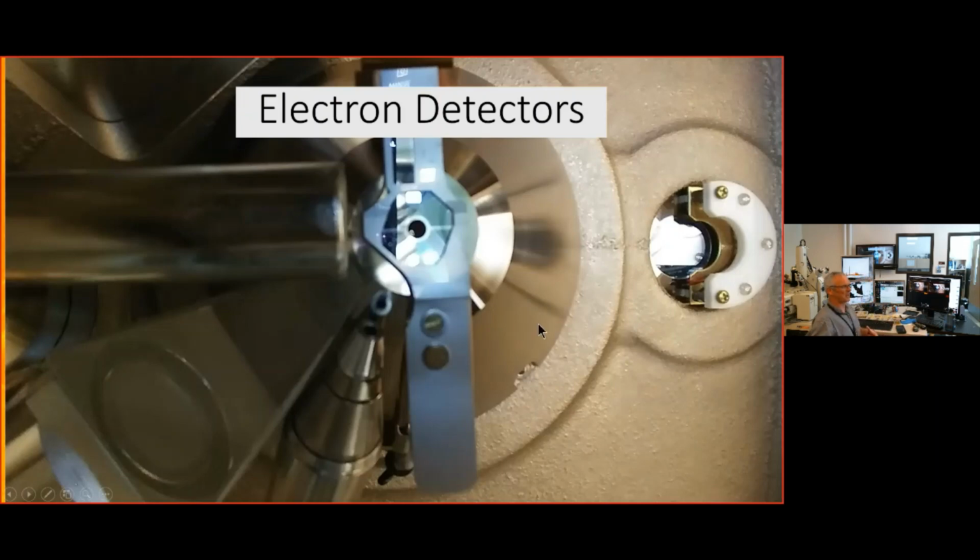I'm going over a lot of the details here because we don't really need that for what I want to talk to you guys about today. So how does the secondary electron detector work?